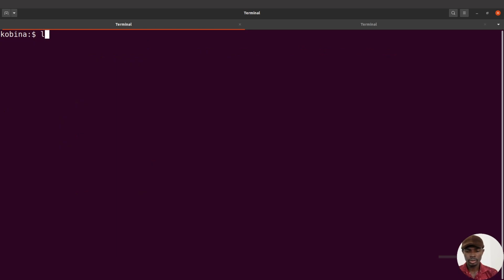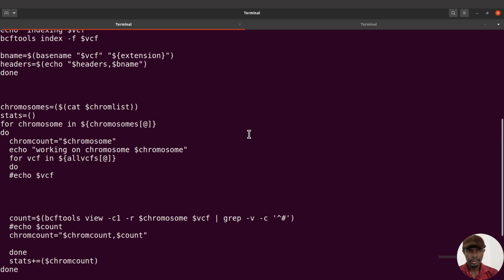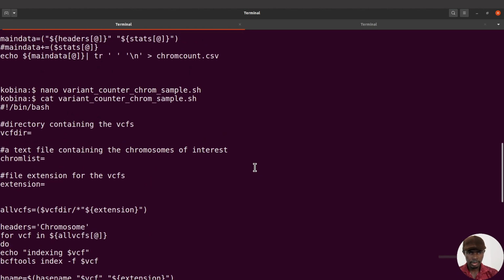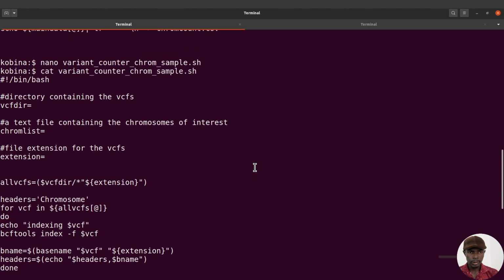Let me do an ls first. Let's say cat. I'll supply the file name like this. That's this one here. Now display it. Okay, so I have the script displayed here for me. Okay, so that's it.